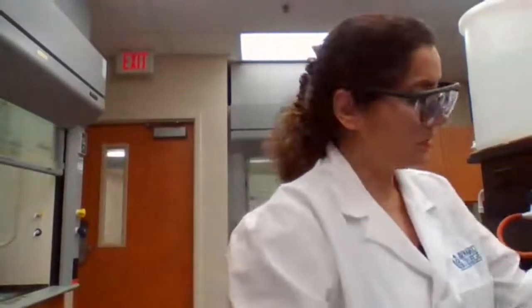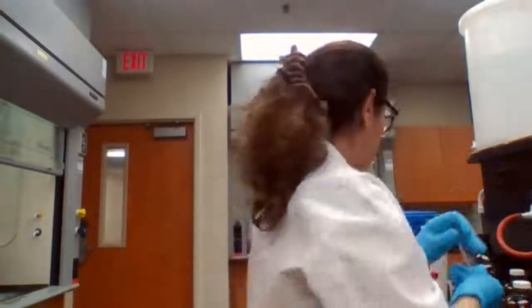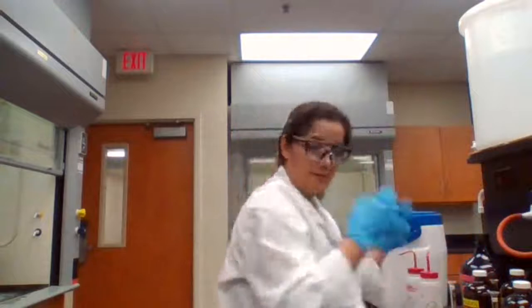Please take a clean test tube and add 1 milliliter of 0.1 molar potassium chromate. So we're just going to add 1 milliliter of potassium chromate.